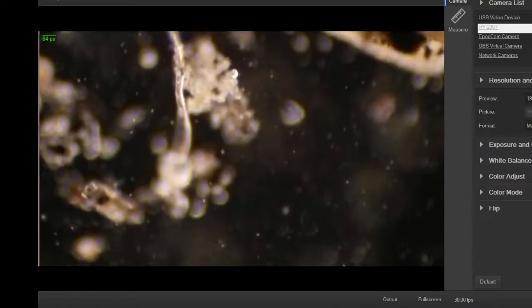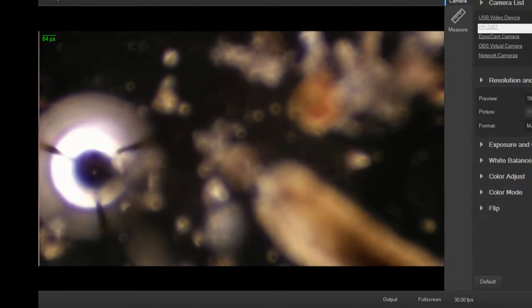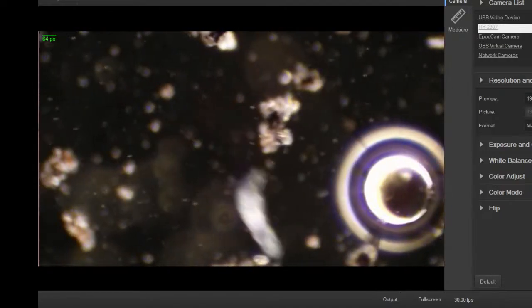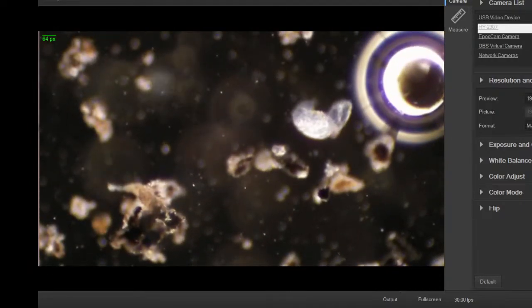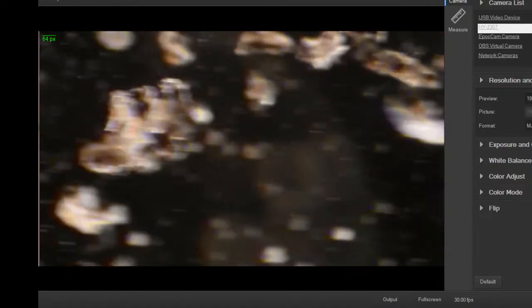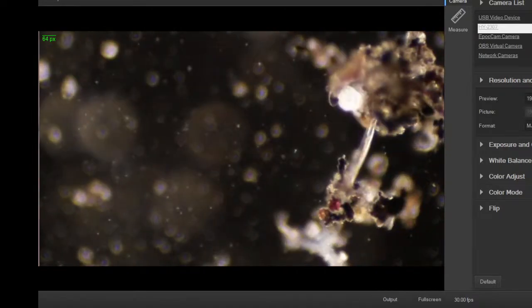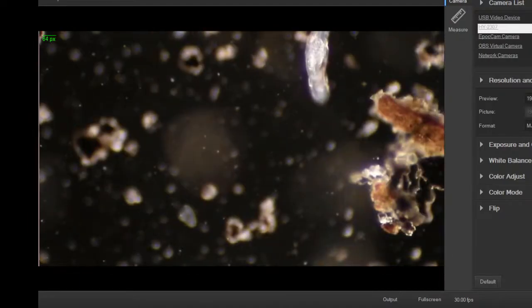Active. Jumping on it. So some of these are aggressive. They're going around and hunt. The other ones kind of attach and just suck the food in, creating a little vortex. And some of those are kind of a mixture of the two. Or the inchworming thing. You saw them doing on the leaf earlier, the grass leaf.